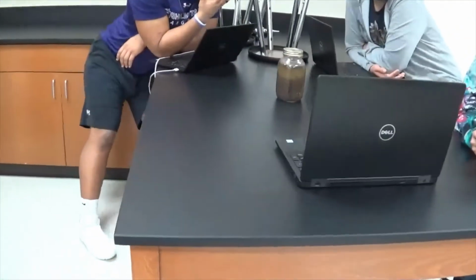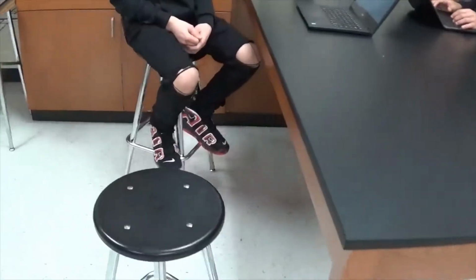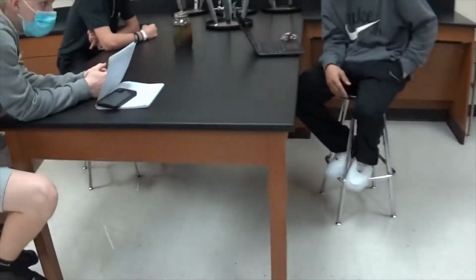All right? All of that floating at the top is organic matter. It's things like roots and, as Ethan said, wood chips, things like that. So the soil has been separated from the organic matter, those things that aren't soil. What else do you notice?